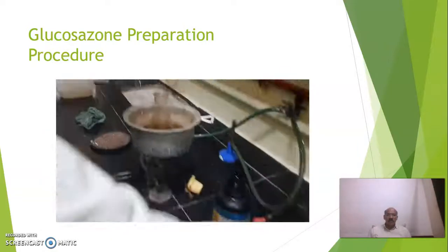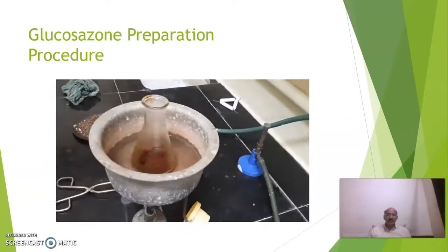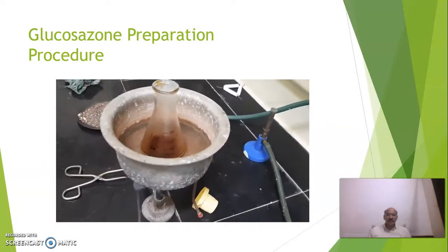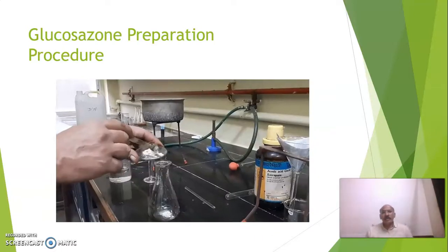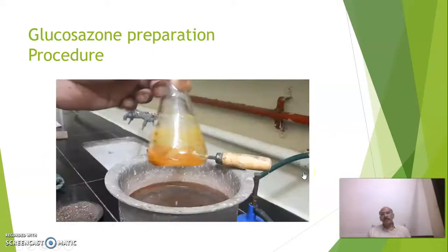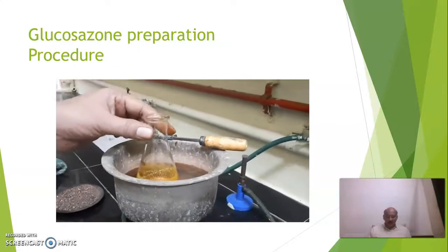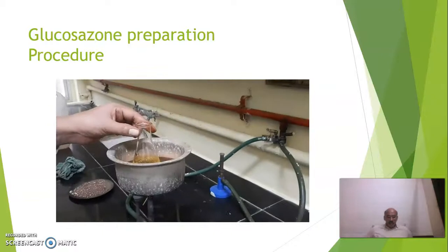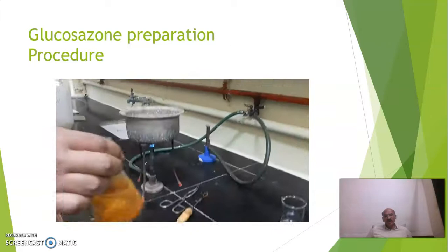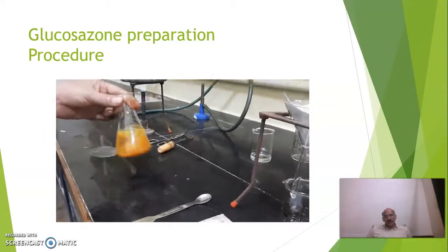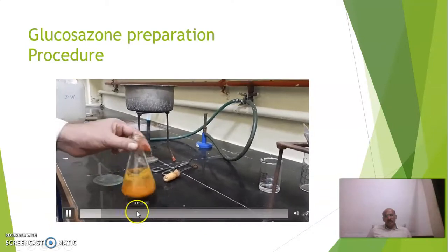Yellow color product formation will take place. For around 35 to 45 minutes we have to heat it. Yellow color product formation will take place.